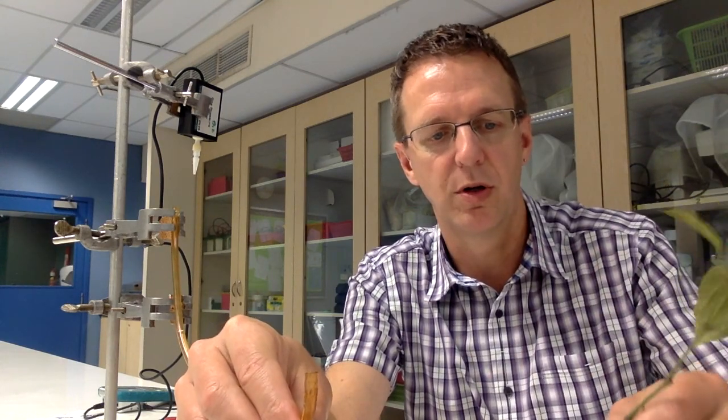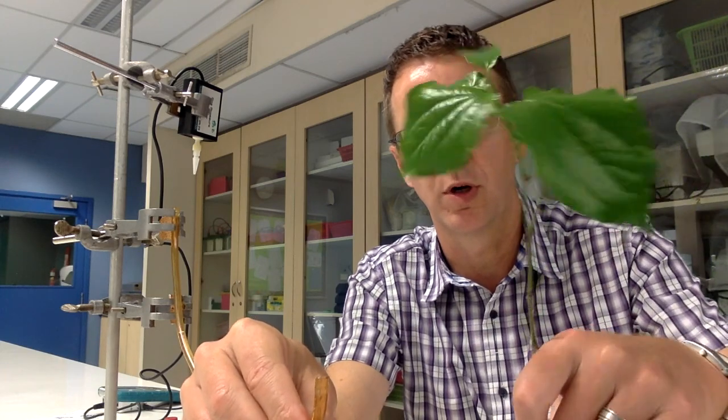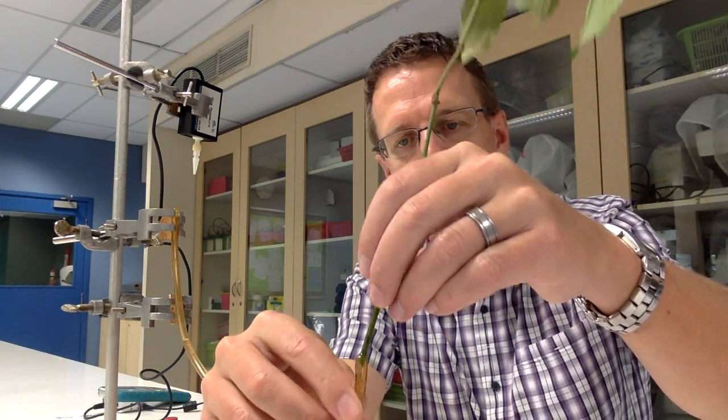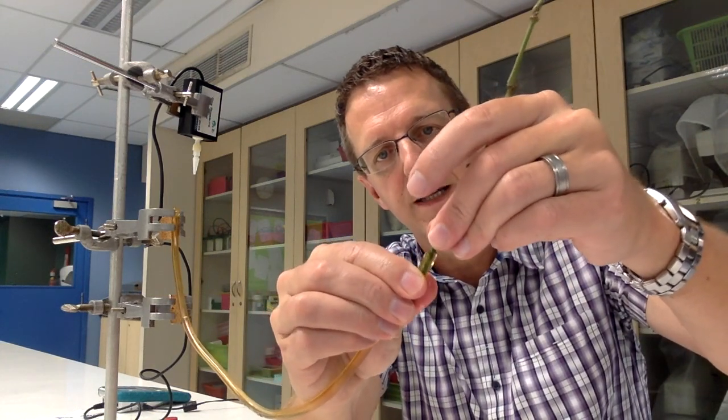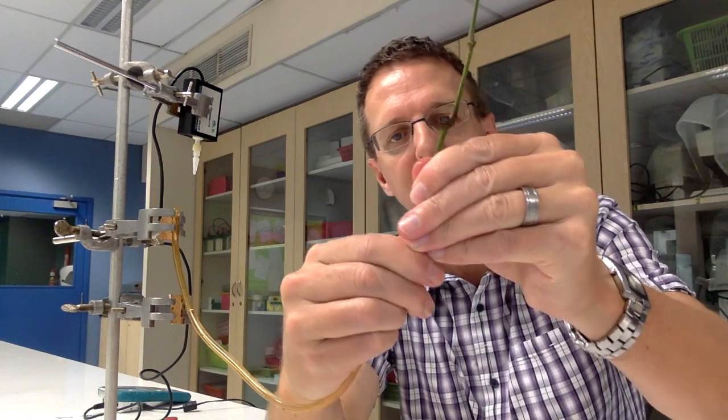Cut a new 45 degree angle on your stem of your plant. I've already done that. But you want to do it under water because you want no air to come into the stem, otherwise it's not going to work. So you cut it under water and then as quick as you can, you want to move the plant over to the tube. And you want to just insert it as far as it goes without breaking the stem.